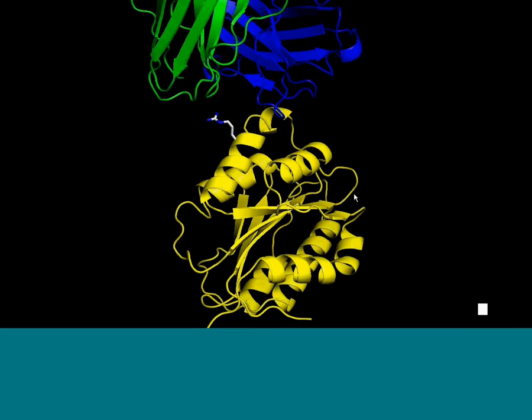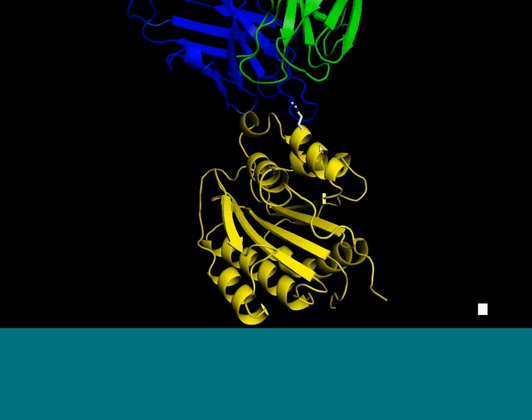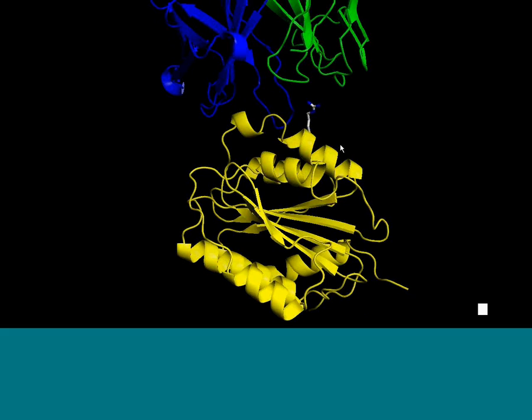Well, I think we've actually not directly used other antibody capture methods because this did work pretty well from the very beginning. This is the way we went. But there's a number of different approaches that are used out there where one uses a capture antibody. In our situation, we're putting EDTA on to regenerate the antibody and release anything that's bound to it, and we've shown we can do that for hundreds of cycles without loss of binding ability. Now, if we did the same thing even with an antibody, which tends to be fairly rugged, but we were exposing it to magnesium chloride or SDS or pH extremes, there's going to ultimately be a degradation with time, and maybe you wouldn't be able to get 100 different cycles out of that chip.